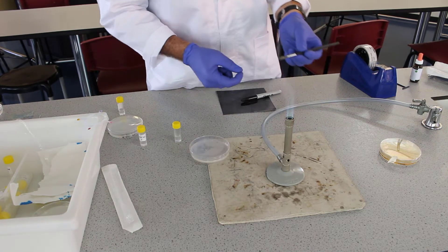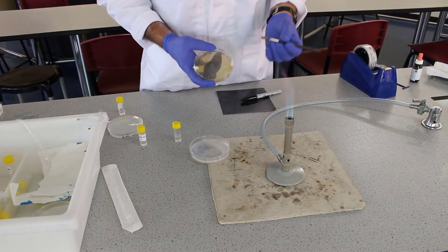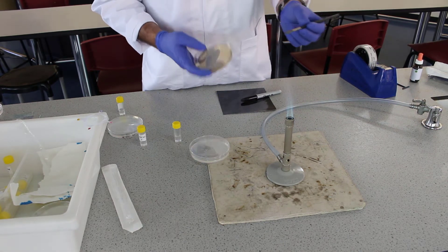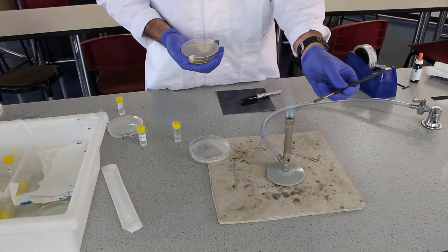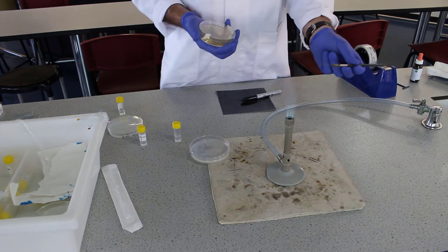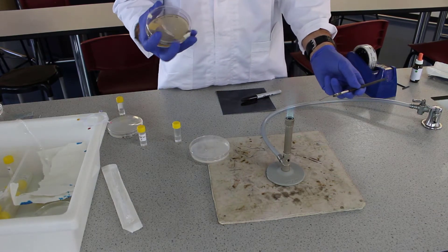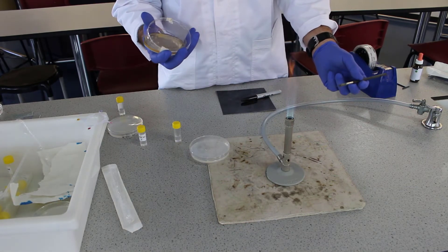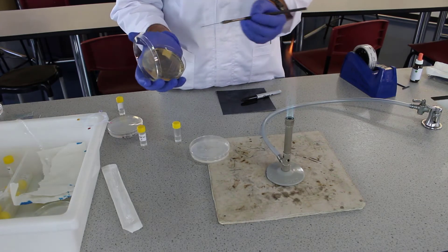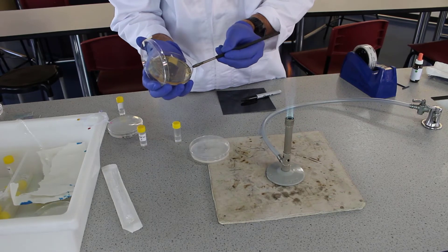We're going to use a metal loop to take our single colony from our master plate and do the 16-streak dilution. So the first thing we need to do is flame the loop. We do that by passing the loop through the flame until it's red hot, wait for it to cool down, and then we're going to find a single colony in our master plate that we can take by sliding the loop across the colony.